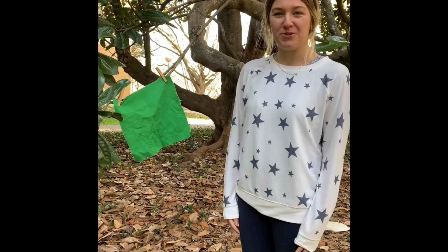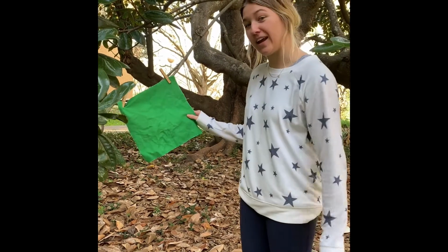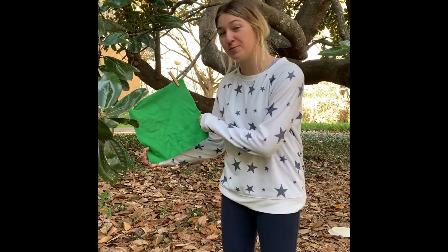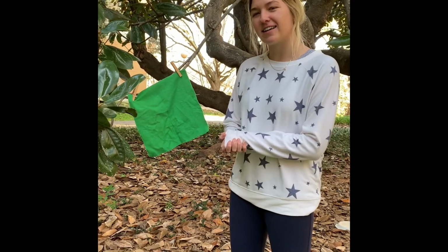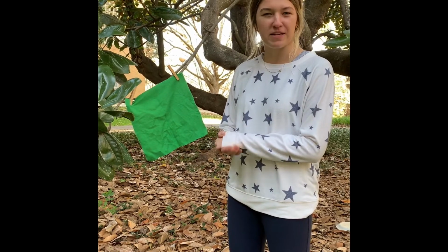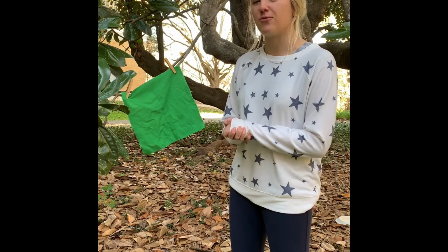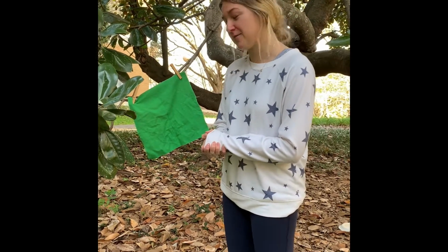We chose to do the ASTM weathering resistance for our fabric. Our fabric is 100% cotton and our end use is pajama bottoms. And while this isn't technically very relevant for our end use, because you don't wear pajama bottoms outside, it is still relevant to know for the durability of the fabric.